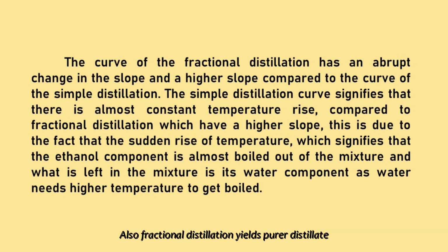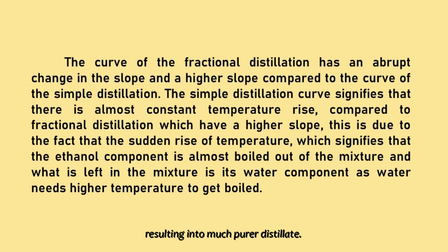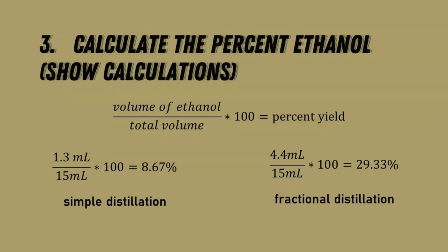Also, fractional distillation yields pure distillate because we are continuously boiling the ethanol, and at the same time, the ethanol condenses once it rises in the fractionating column, resulting in much purer distillate.